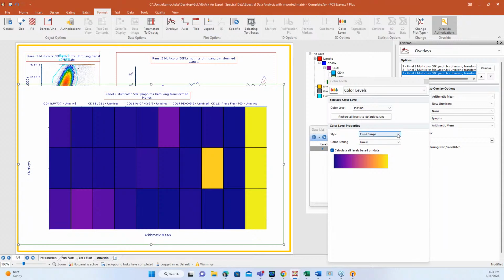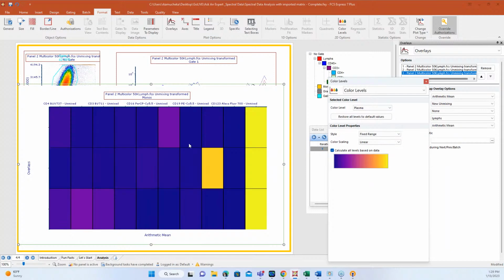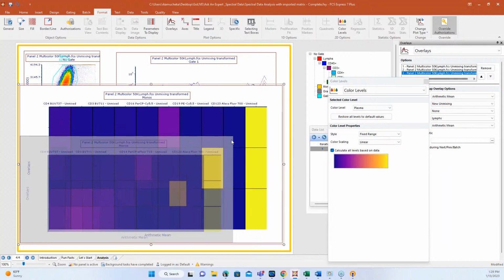And like Holly was saying, if you're doing a quick screen, one of the things I like to do is thresholds. So you can basically just say, if it's below this value I set, I change it one color, and if it's above that, I change another. And then you just have off and on scaling and you can see, oh, this is it, this is it. You can quickly look through a lot of information to see what's happening with your data. That's really a useful tool when you're just trying to glean as much information out as you can.